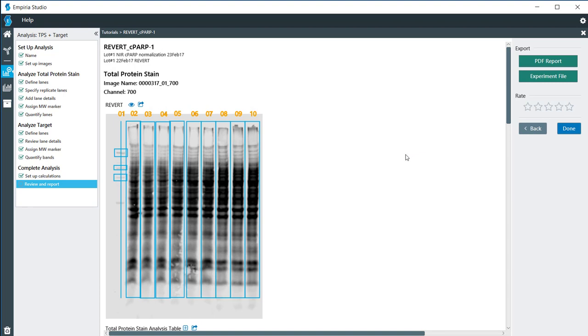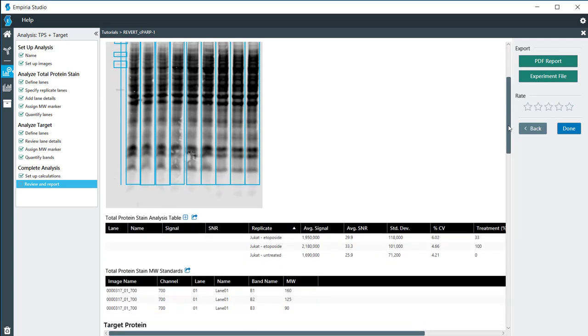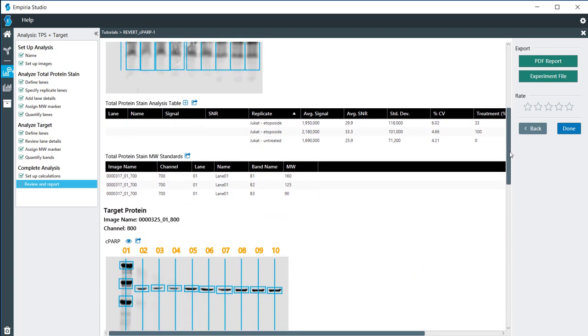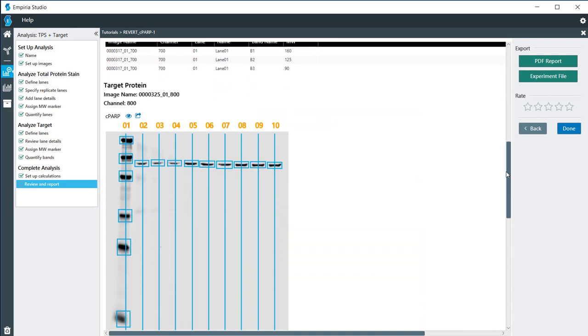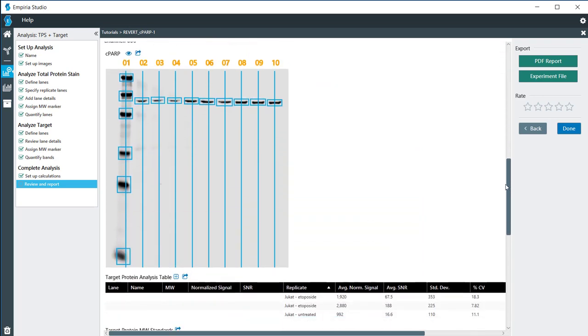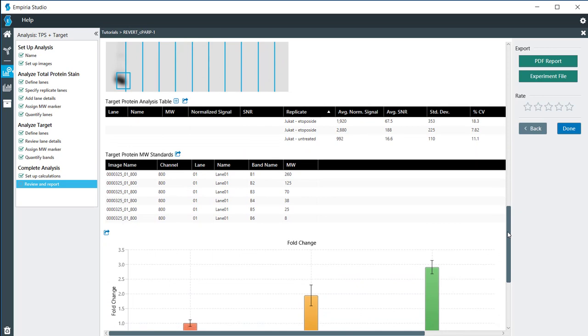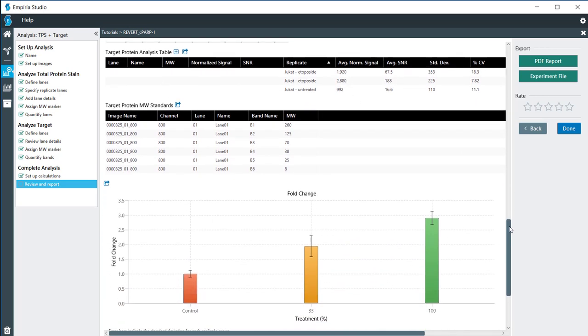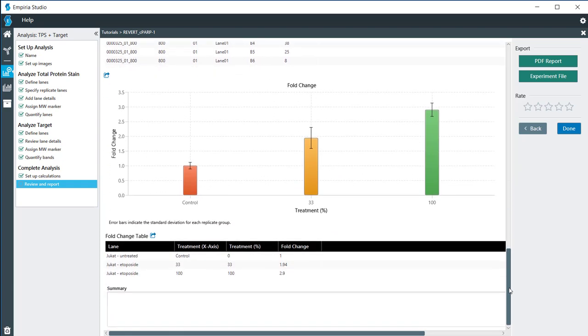Here in the final section, the Review and Report, we have the image of the Revert on here. As we scroll down, we can see that we get the signal for each one of those for the normalization. As we go down further here, we have the target. It has the information for the normalized signal and then also the molecular weights and the fold change chart.